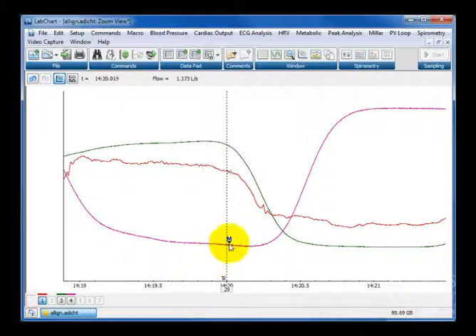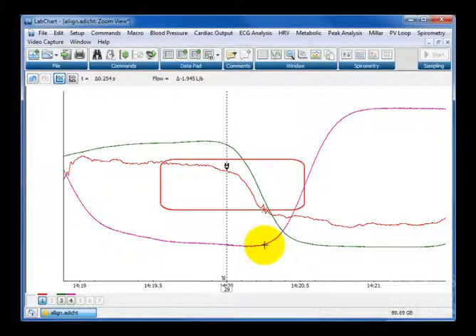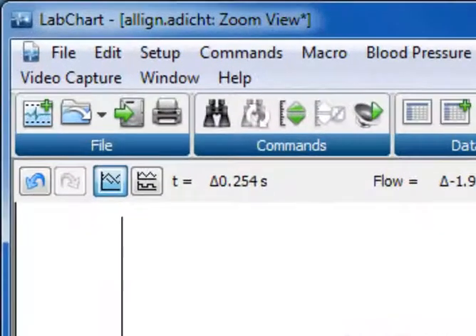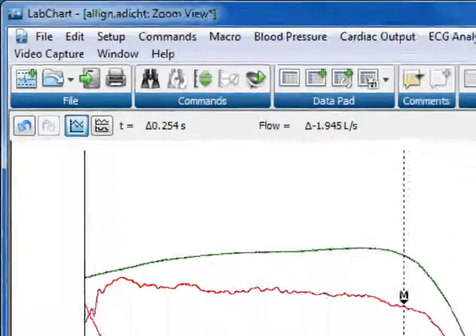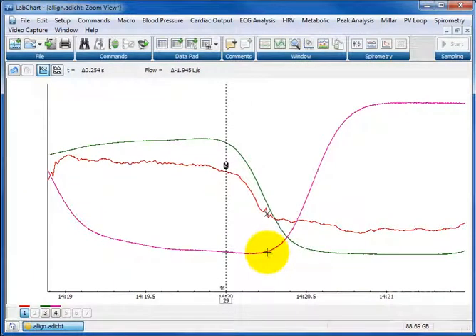So I can drop my marker right there, and then I can hold my mouse to a point where I believe my end tidal measurement actually would be in the purple trace here. And here we are, it's about the similar point about there, and if I look up above in the t equals, you can see at the top there it says t equals delta 0.254 seconds. So the lag time for this measurement is 254 milliseconds, so I make a mental note of 254 milliseconds.